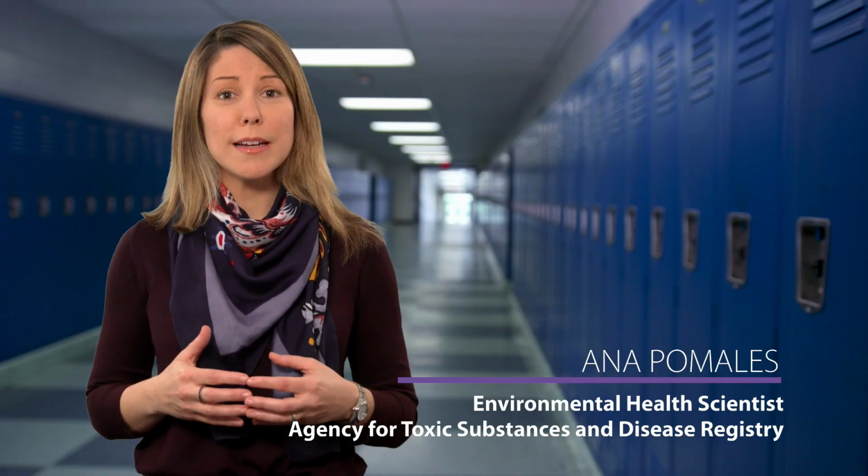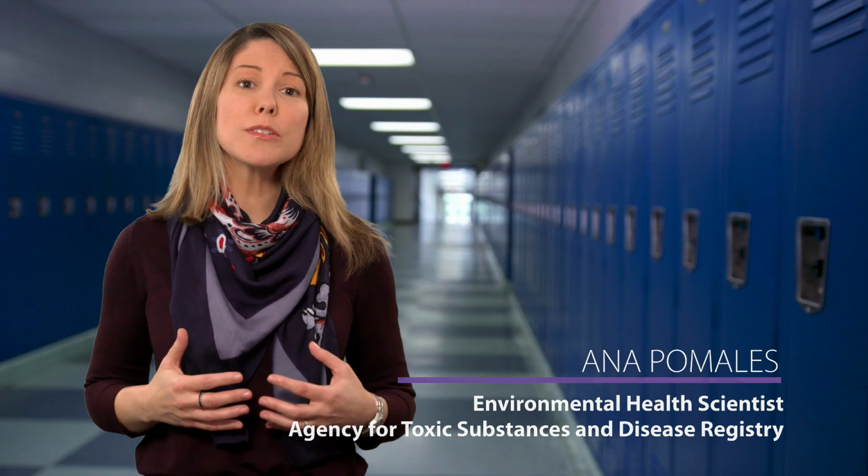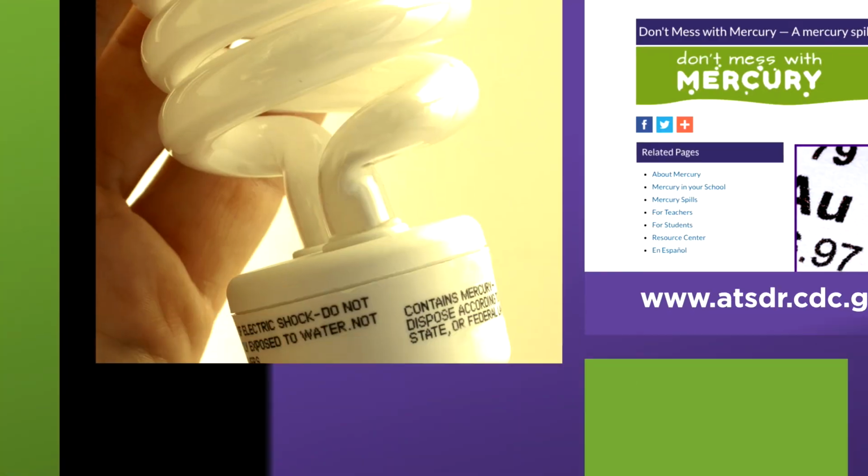Hello! This series of videos will familiarize you with the dangers of elemental mercury and the proper way of cleaning up a spill. This video will help you understand the importance of preventing mercury spills or minimizing their impact if one occurs. ATSDR's Don't Mess with Mercury website is a great resource to learn more about mercury.